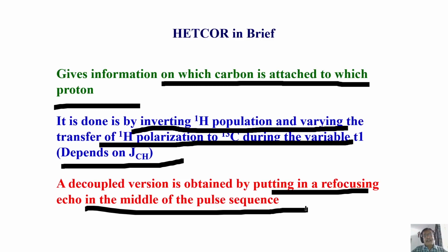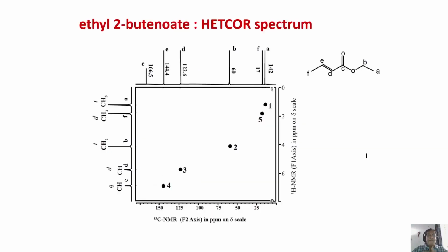Immediately after polarization transfer, if you start collecting the signal and start doing the decoupling, the antiphase components will be there. It will nullify the gain that you have achieved. As a consequence, we can do some tricks so that you get in-phase components which add up and give us enhanced intensity. That's what is normally done.